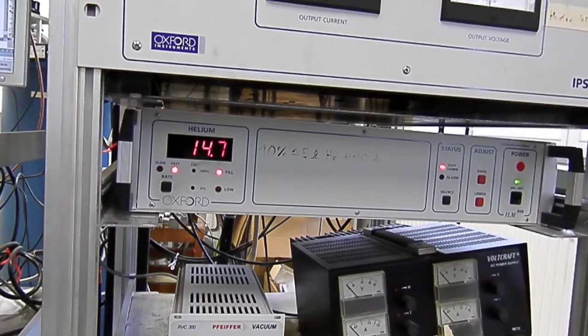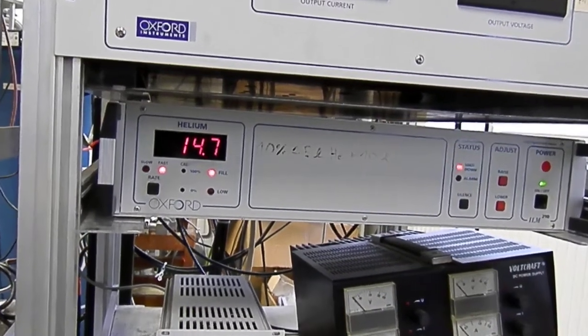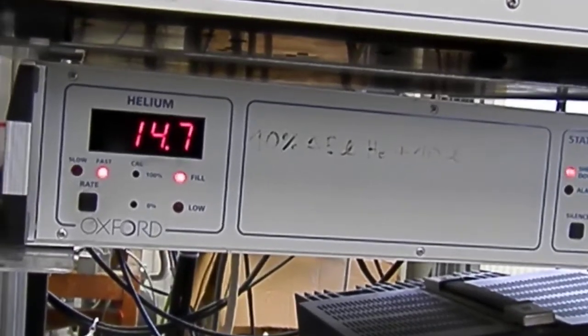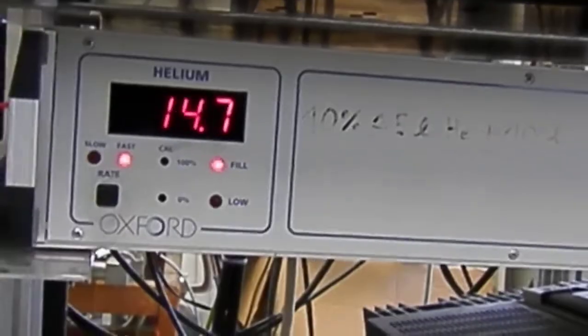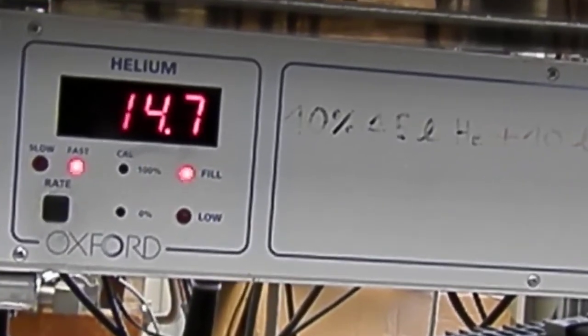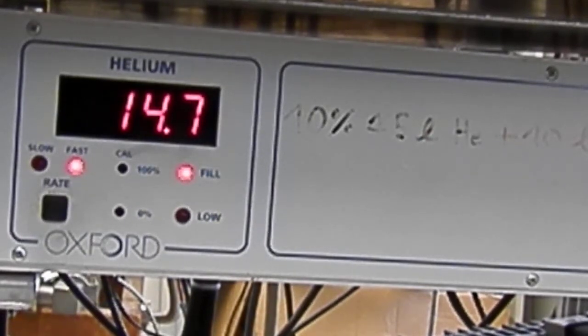It's called the helium level meter. You can see the meter is showing 14.7 percent. That means we have to fill to 100 percent, and it's currently only showing 14 percent of the helium.